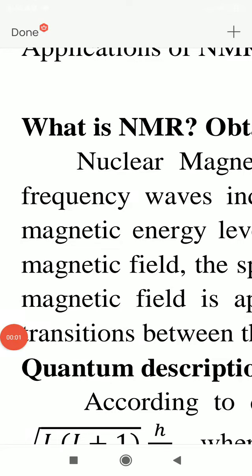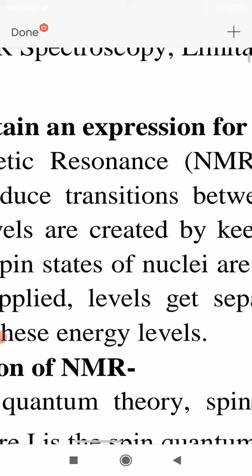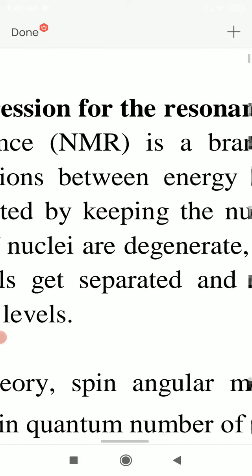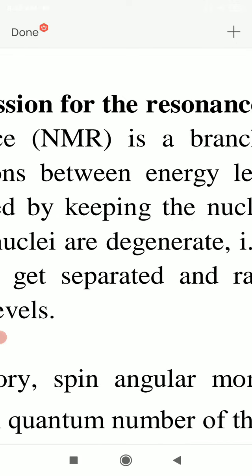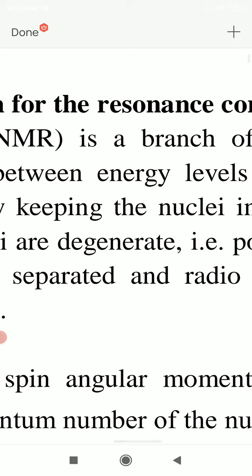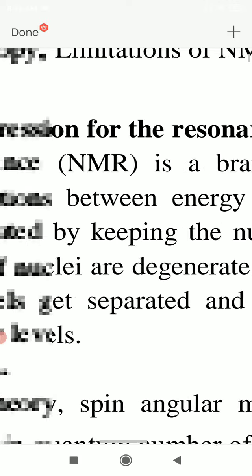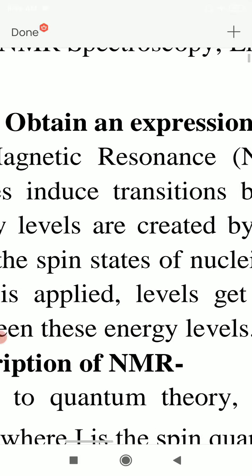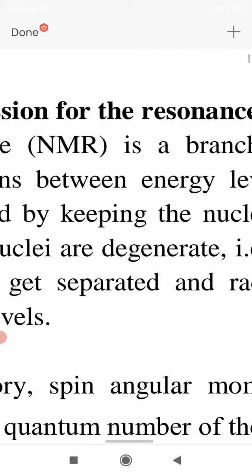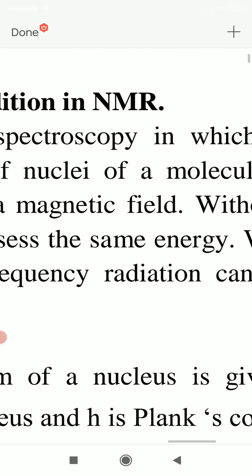Today's topic is NMR, Nuclear Magnetic Resonance. NMR, which is short form of Nuclear Magnetic Resonance, is a branch of spectroscopy in which radio frequency waves induce transitions between energy levels of nuclei of a molecule.